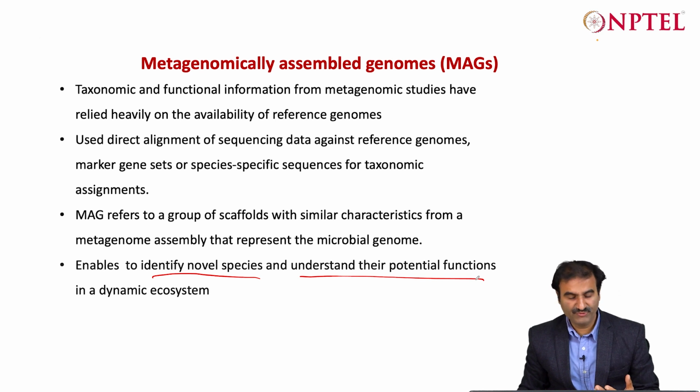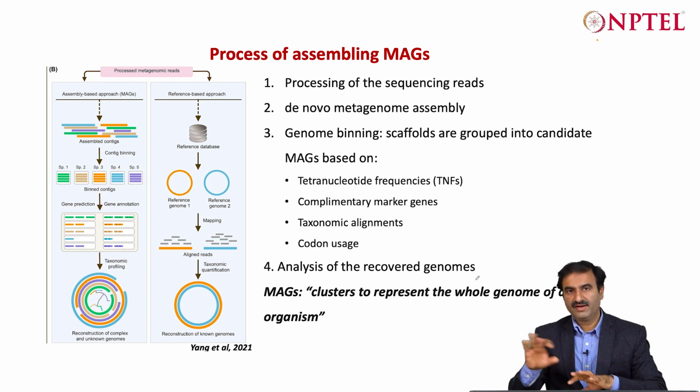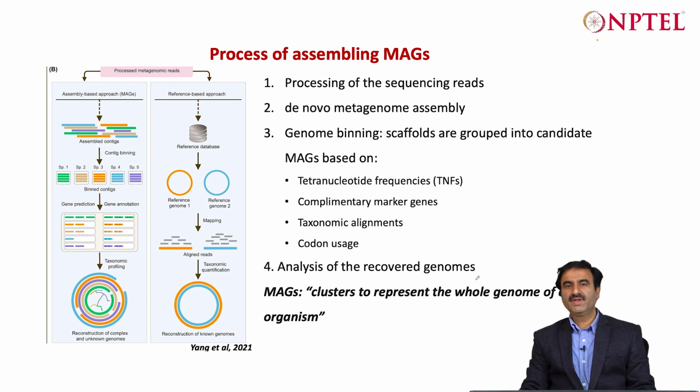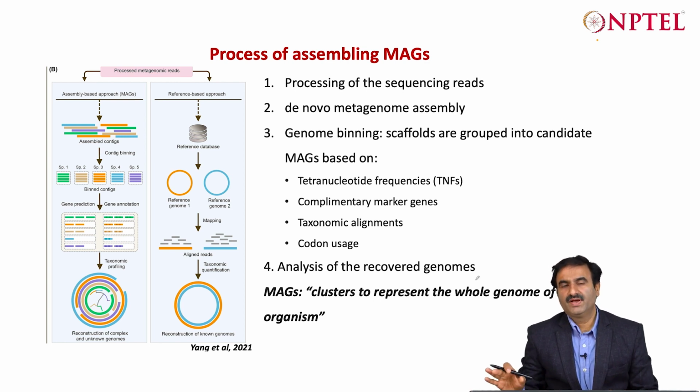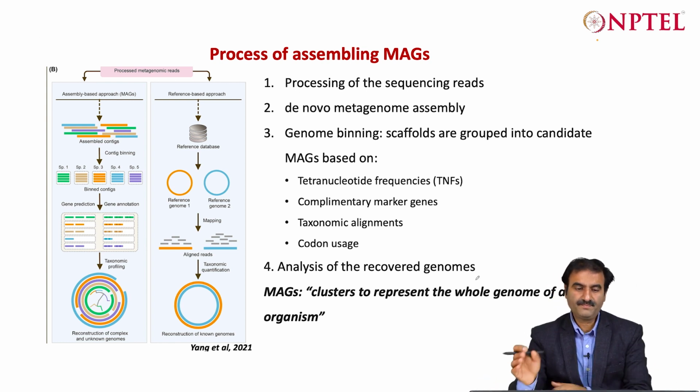So those could be new species that you may not have found otherwise, because this way you have also classified or segregated the data. There could be some bins which can be easily classified, and some bins which are unique and unclassified. So you can do more with these, and you don't get confused with too much bulk data all the time.